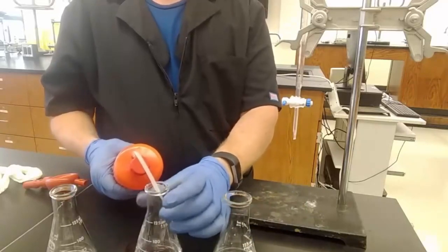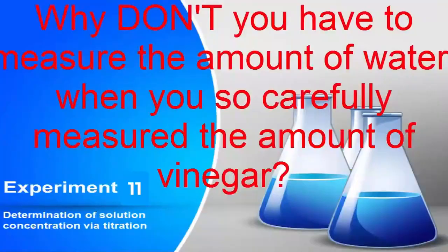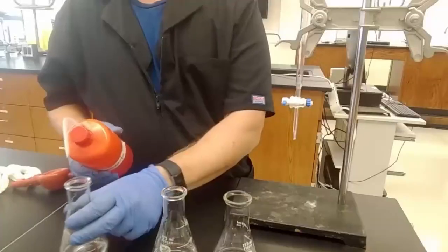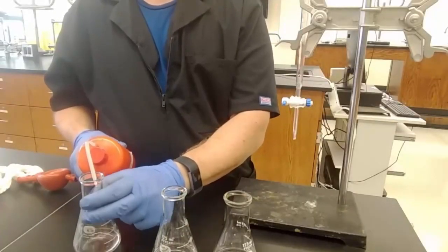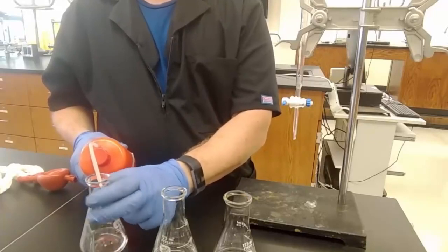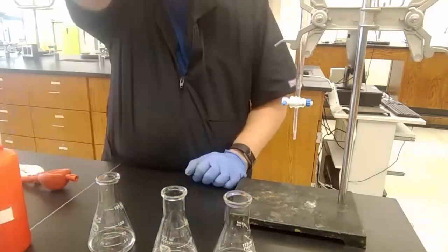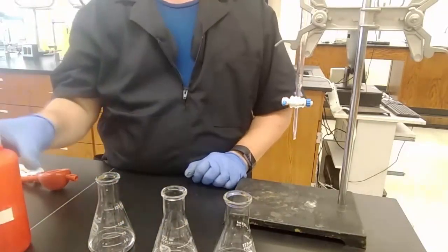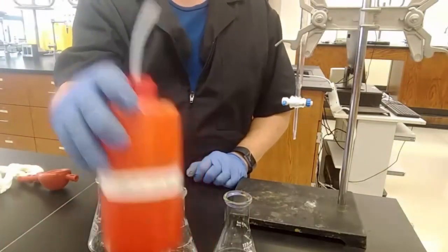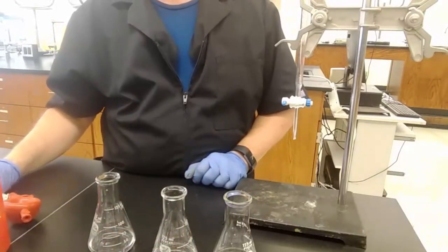Am I measuring the 10 milliliters? I'm not even bothering, because at about 10 milliliters of water, it doesn't matter how much water we add. We added 10 milliliters of vinegar, exactly. And that's what we're interested in, because the amount of acid that's in there is the amount of acid that's in there, assuming that our deionized water is, in fact, this week, deionized. The water isn't changing the amount of acid present.